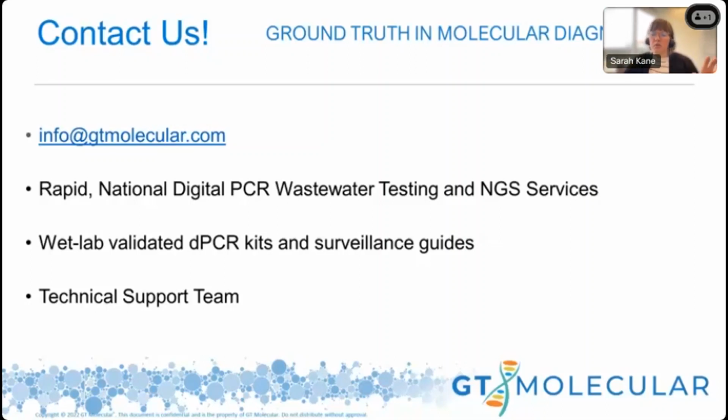And then the other workflow will be more of a gentle, sort of traditional extraction. So greedily, if that's even a word, I was being very greedy at the onset of this work, and I wanted to find one universal extraction method, and it might be out there, but we haven't come across it just yet, David. So if you happen to have any suggestions or thoughts, I would definitely be willing to try it out. So yeah, awesome. Does anybody else have any other questions, comments?